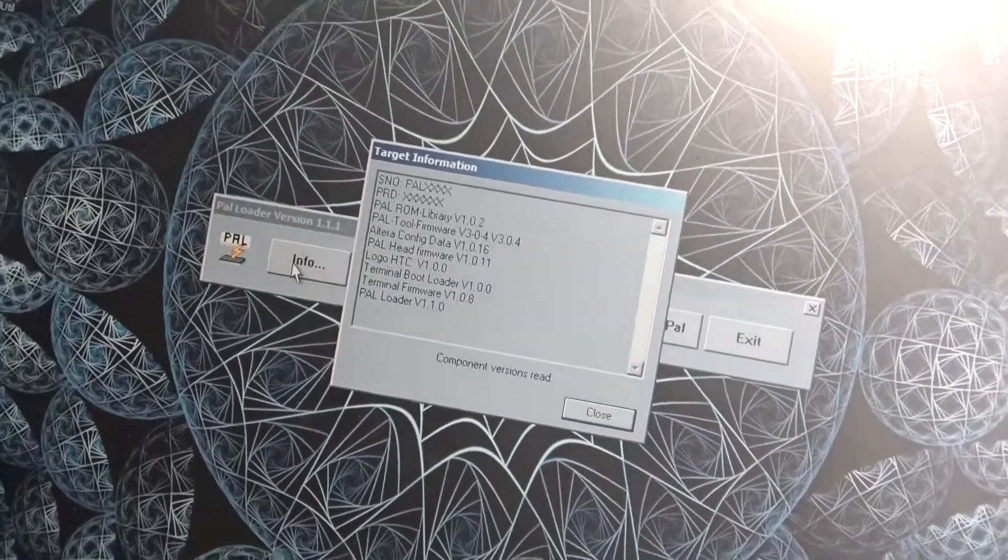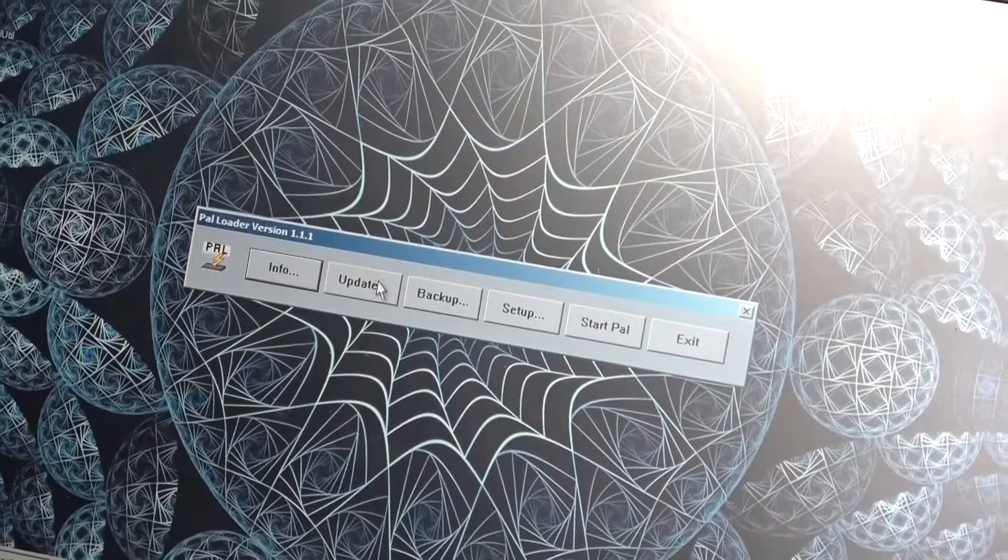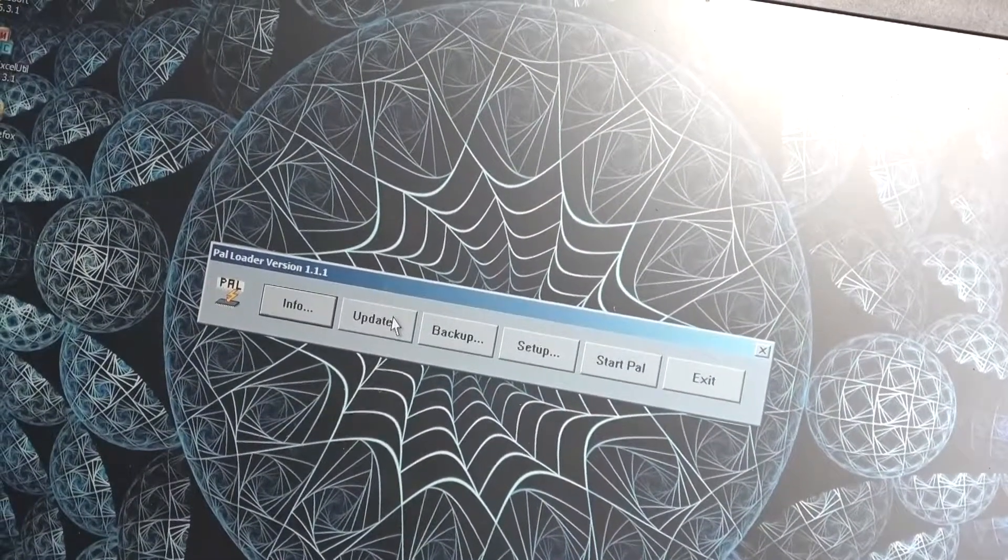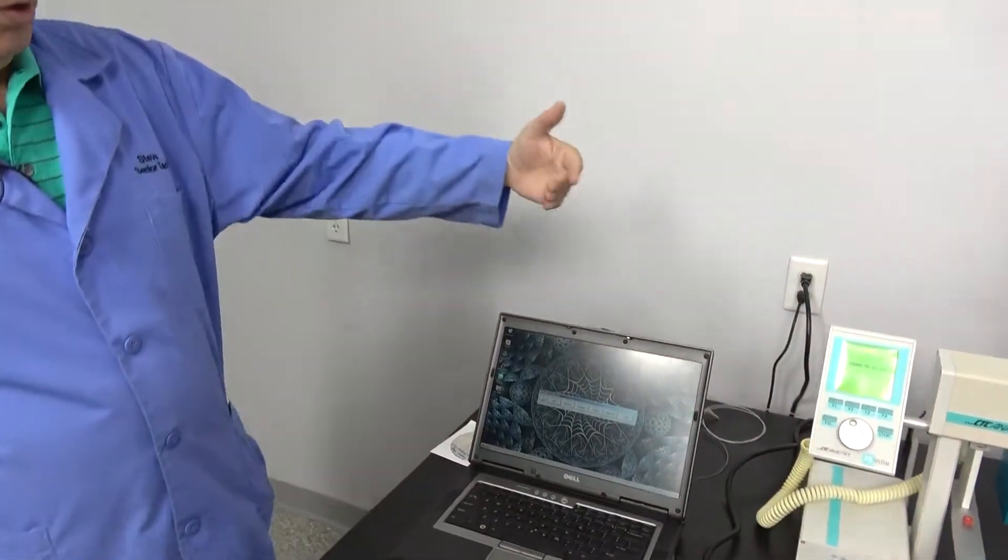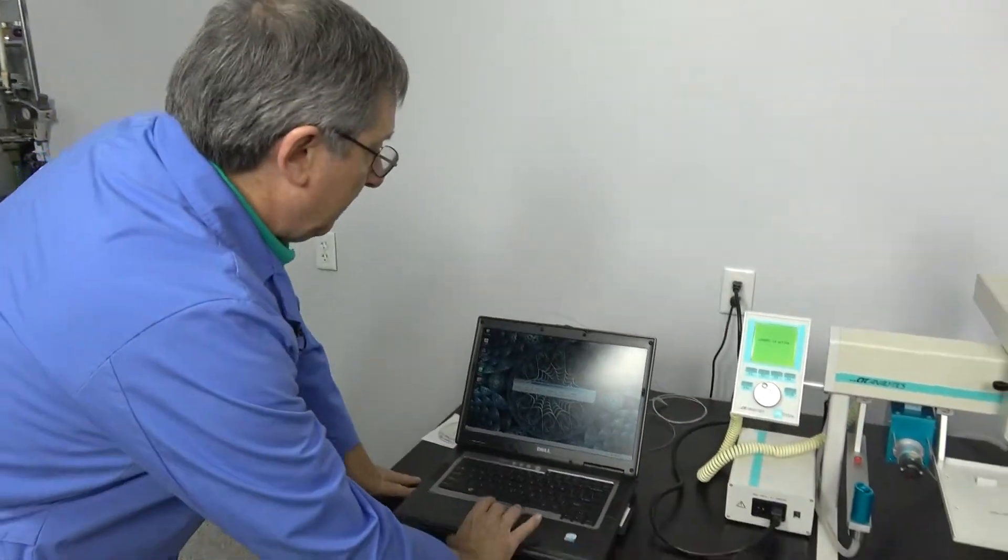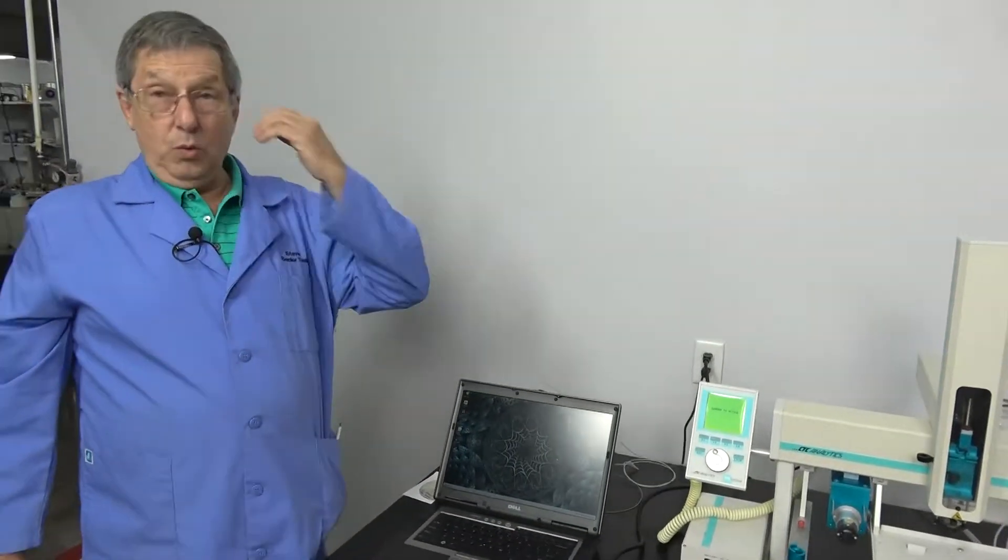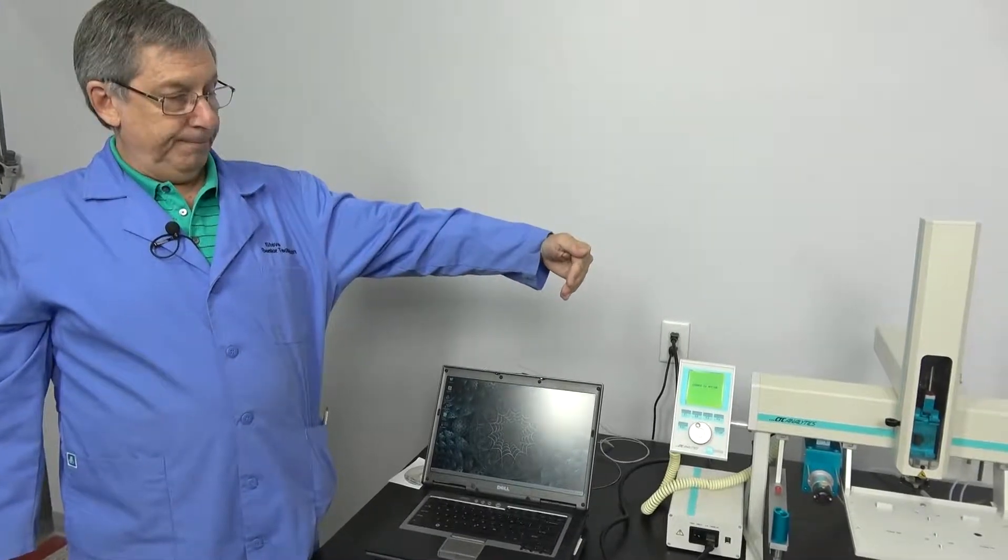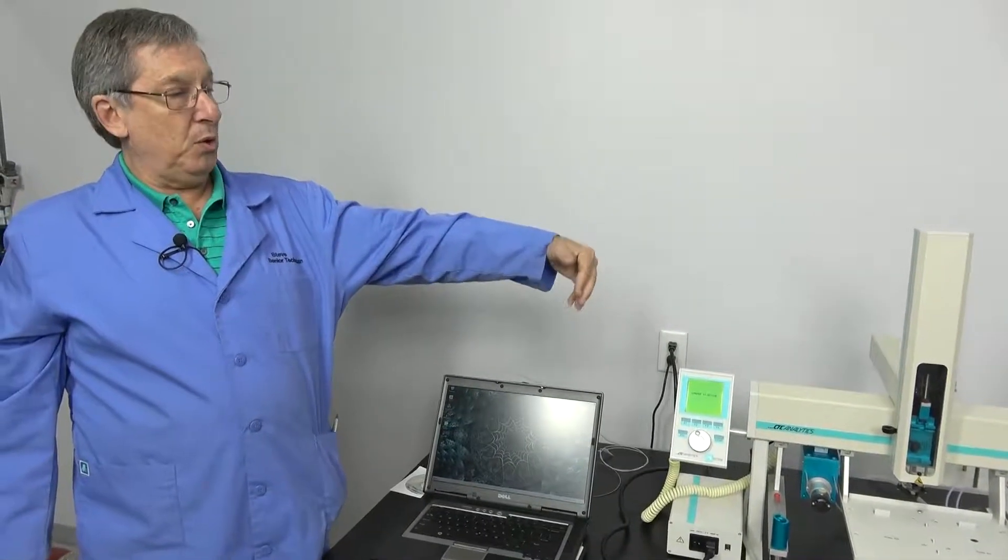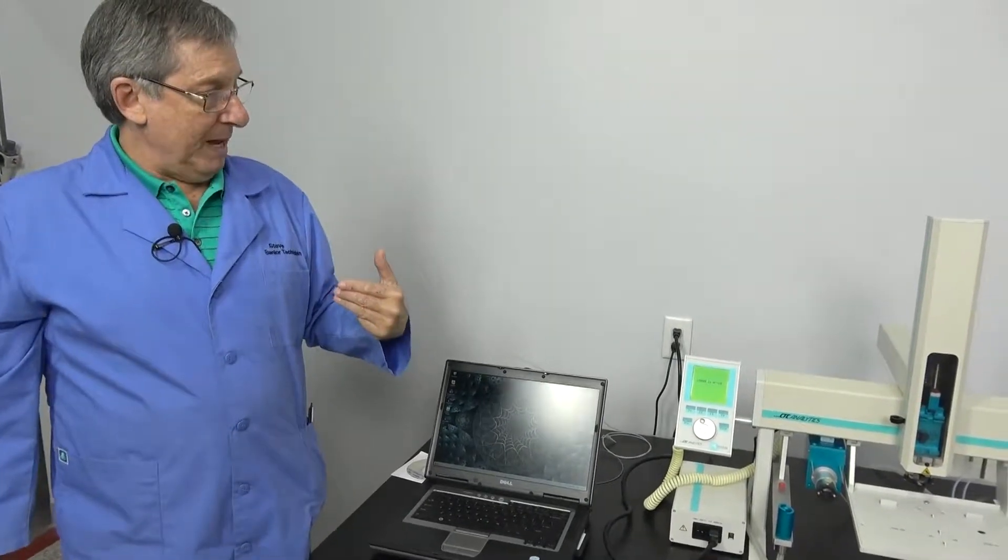After you do an update, there is not going to be any objects loaded. So you're going to go to your controller and you're not going to be able to tell it that you want to test the drive motor or the washer or to change the location. Both of those things we'll be talking more about in just a few minutes.